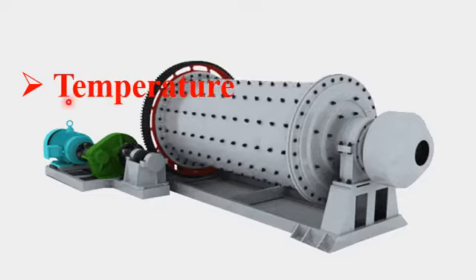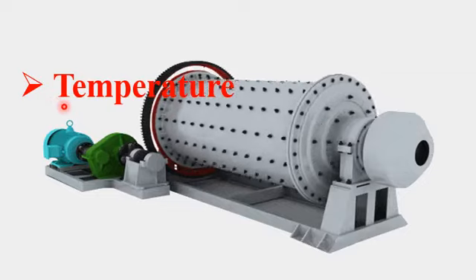However, in metals the temperature may be used in ball milling operations in a positive sense, because metals can be extracted and are not too brittle. Basically they are flexible to the temperature, and the temperature inside the ball milling apparatus may effectively improve the quality of the final nanoparticles in the case of metals.